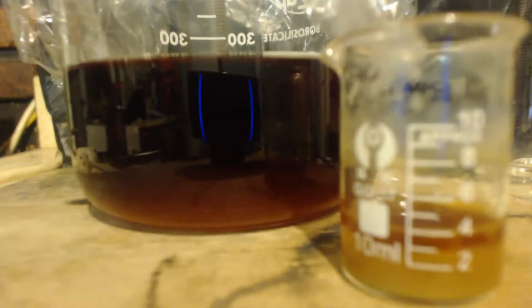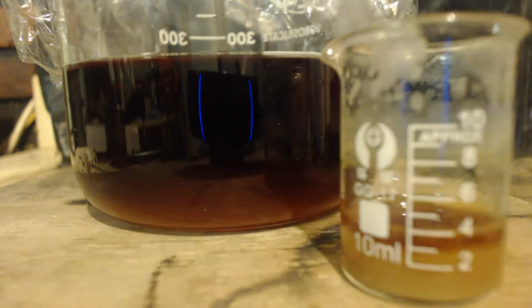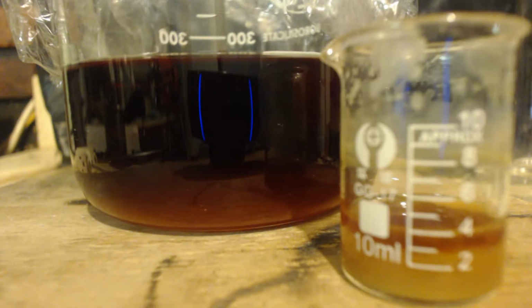Okay, I lost the footage. Basically, what's happened so far is I refluxed for 7.5 hours. I filtered out what I had, and then I refluxed it for another, let's say, 50 hours. Okay, maybe even 60, 55.